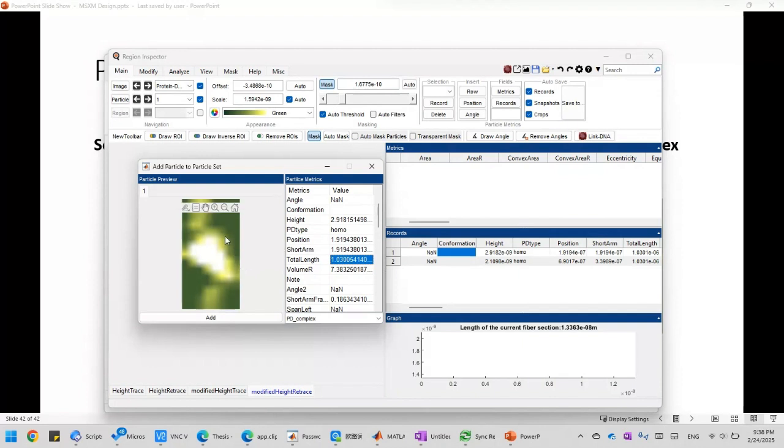If the protein binds to a damaged DNA site, it can exhibit a specific conformation versus when it binds to a non-damaged site. So we need to know the position information to distinguish potential differences in their conformations.